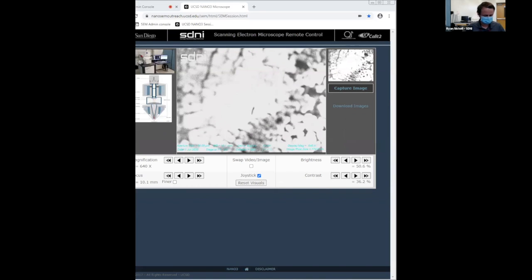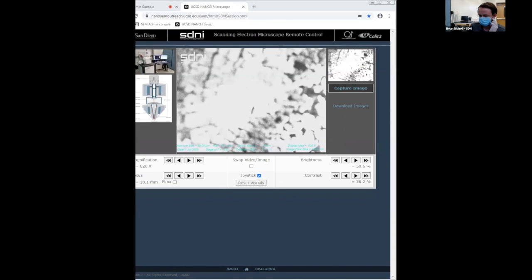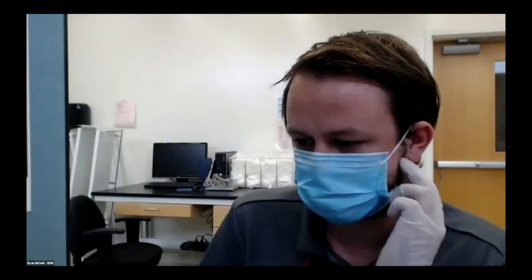So what's nice is Ryan's system is actually just a web page typically, but because we're in this remote setting, it makes it a little bit harder. So the web page isn't working as well, but typically we wouldn't have to do a Zoom and it would be a much smoother interface.